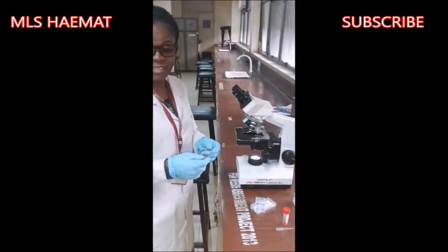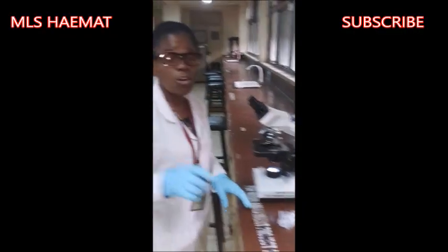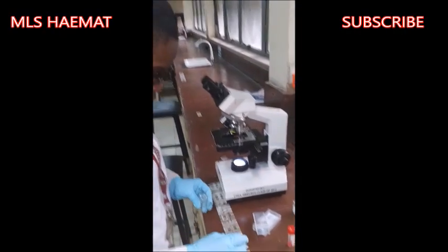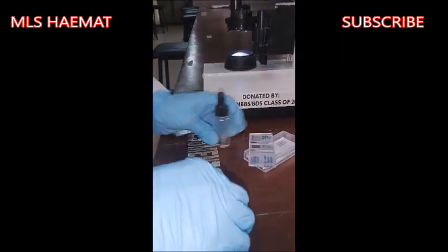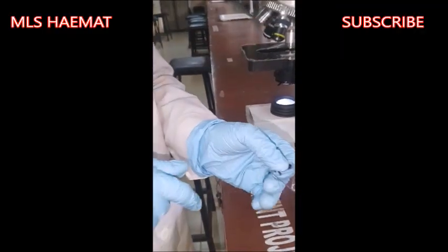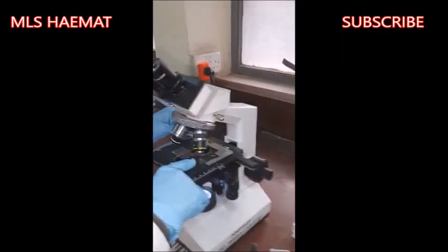Now, this is my stained preparation. I have this stain here and I want to view it under the microscope. For me to view it, I'm going to need what we call immersion oil. And I have my immersion oil inside this bottle. So all you need to do is to open the bottle and place a drop of the immersion oil on the slide at the tail end of the slide, not at the head. You know, the slide has both head and tail. But when you want to view any stained object like this preparation, you're going to work at the tail end, and that's where you put the immersion oil.